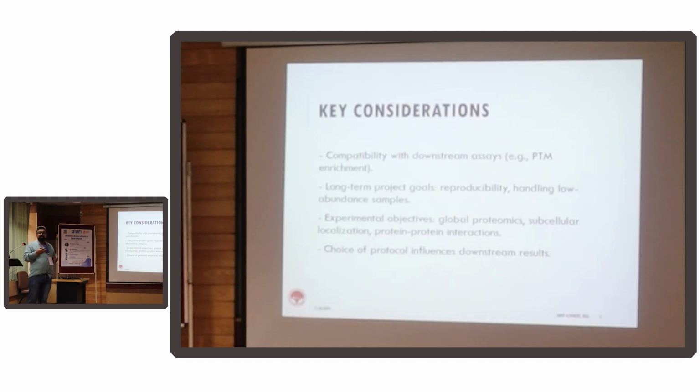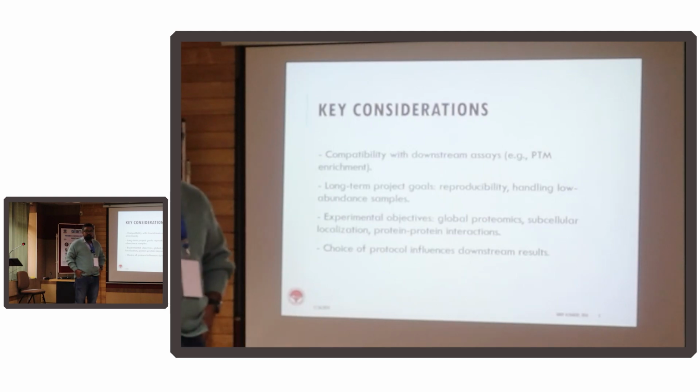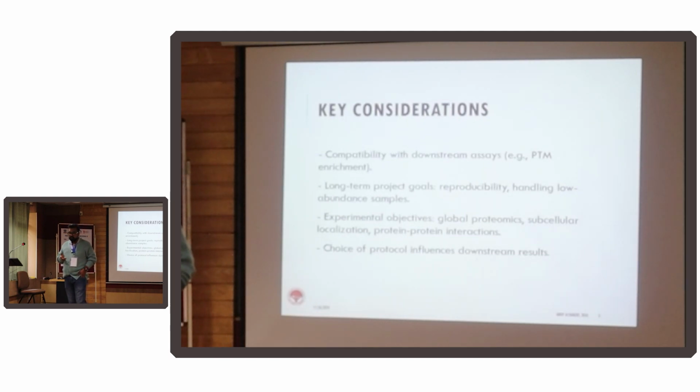Right. So what do we need to consider when we are preparing the sample? Before you start doing an experiment, please do a mind experiment as well. What is your ultimate goal? Do you want to do phosphoproteomics? For that, your sample prep technique would be different. You have to do some phospho enrichment using IMAC columns. Or you want to do glycosylation studies or any type of post-translational modification studies. Your first impact will be that your sample prep technique will change.